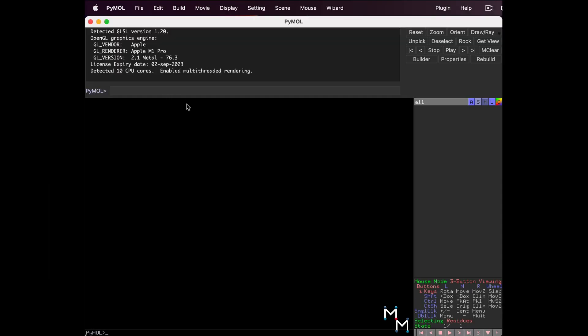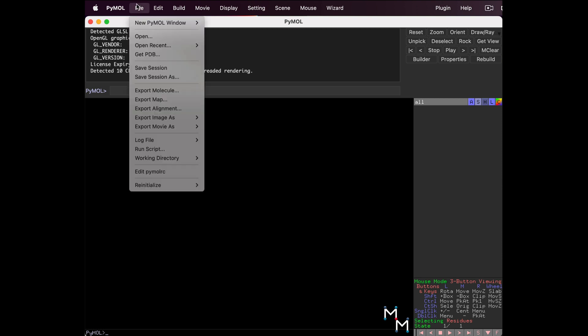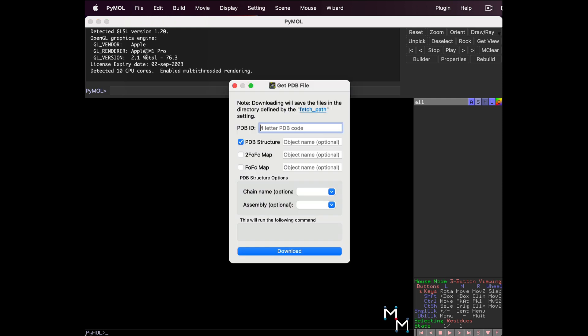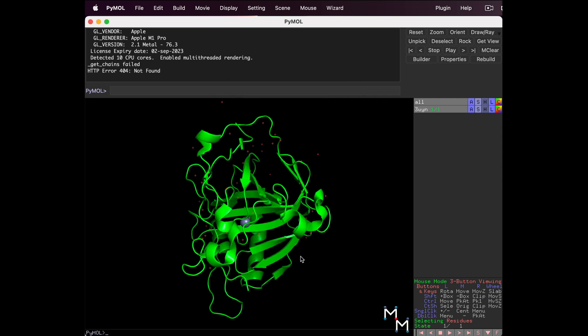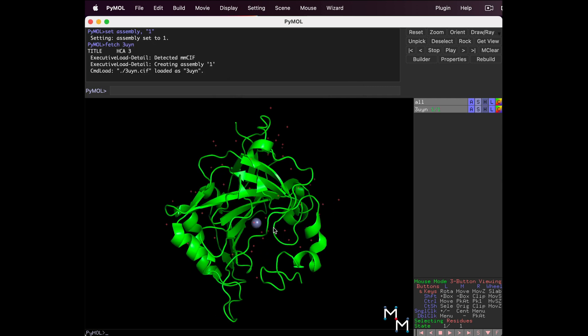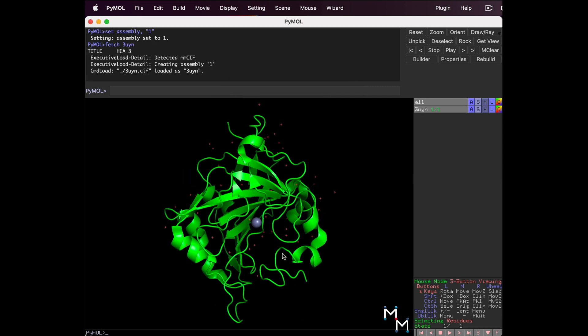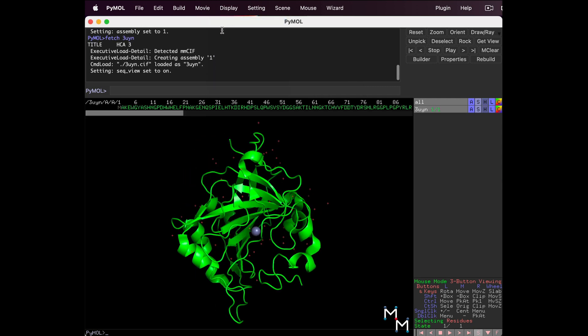In Lesson 1, we learned to load the biological unit of macromolecules. File, get PDB, type 3-U-Y-N. Set the assembly to 1 and click Download. Here's carbonic anhydrase. Display the sequence and we're ready to model.